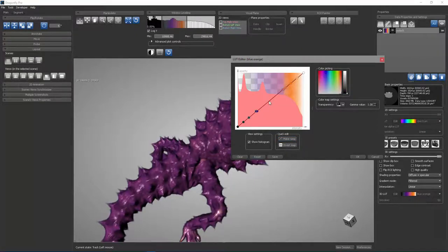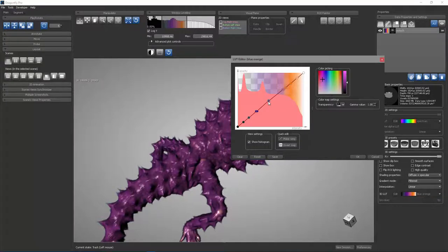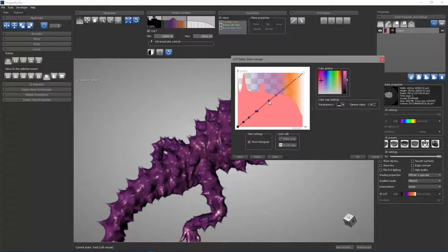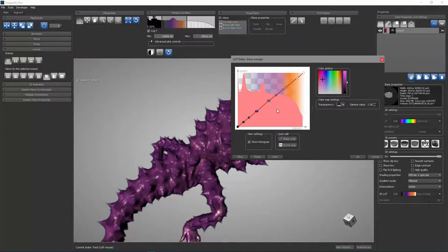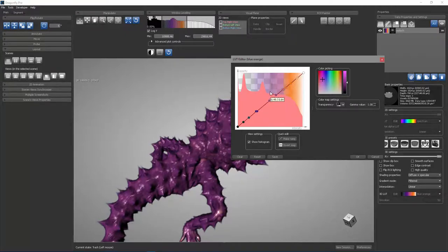You can always click here anywhere to create a new node, and it will take on its current color. You can see that this is a purple node, and this is an orange node, and there's a linear transition between orange and purple. And if I click here, I get that instant color, and then I can manipulate. You also have the ability to right-click on a node and tell it to split the key, which allows you to apply a discontinuity in your lookup table.